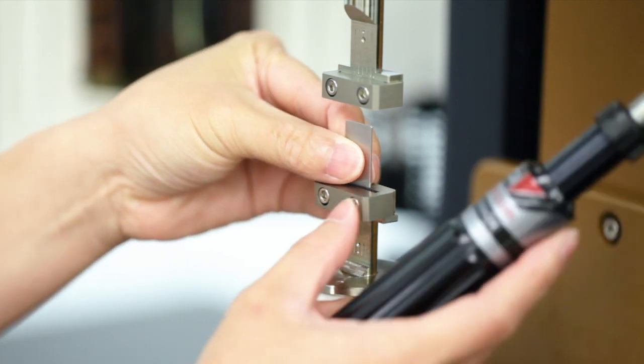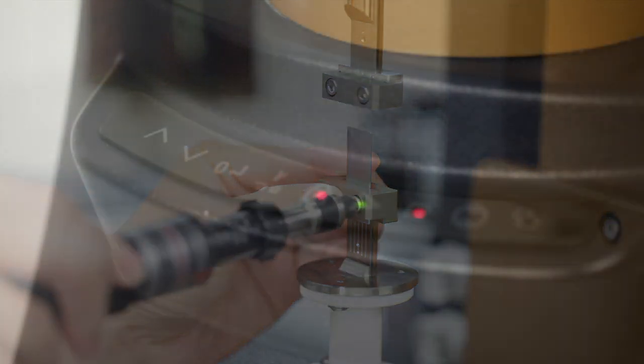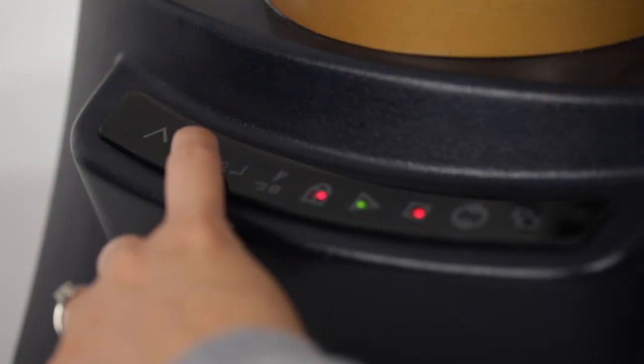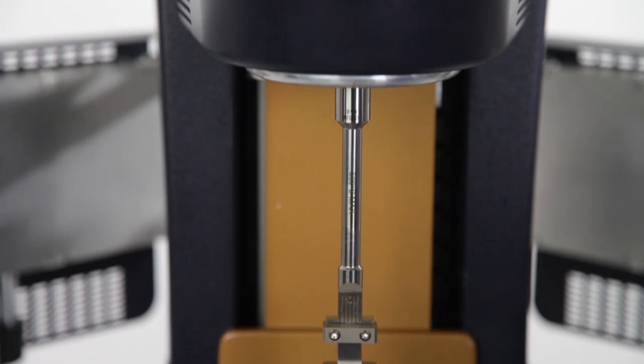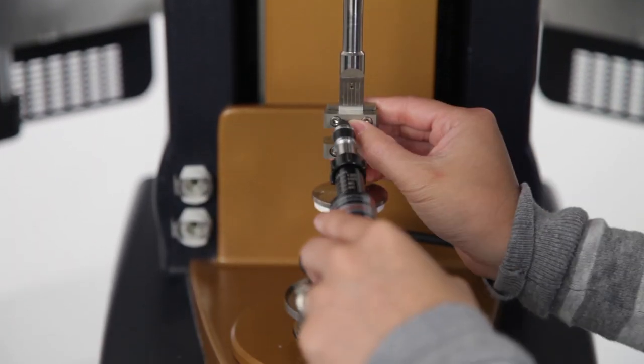Insert the alignment steel shim into the lower geometry fixture. Using the up and down buttons on the keypad, carefully lower the upper geometry until the steel shim is fully inserted into the anvil.